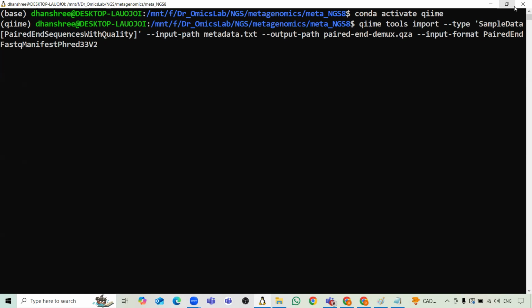Is there any doubt here? Ma'am, could you please once again explain this command? I just missed a few minutes.